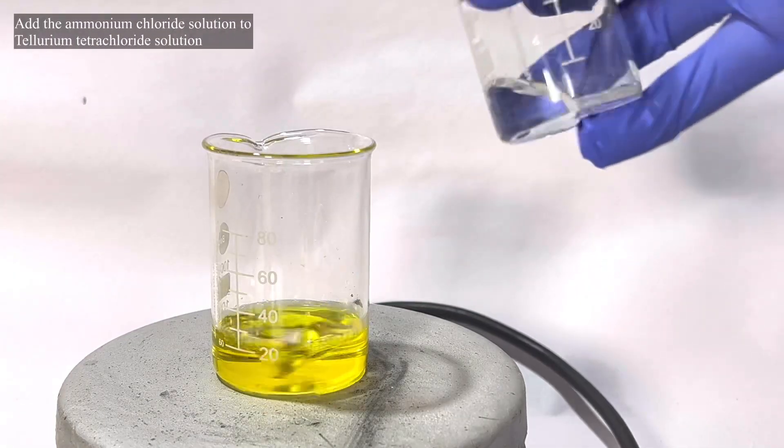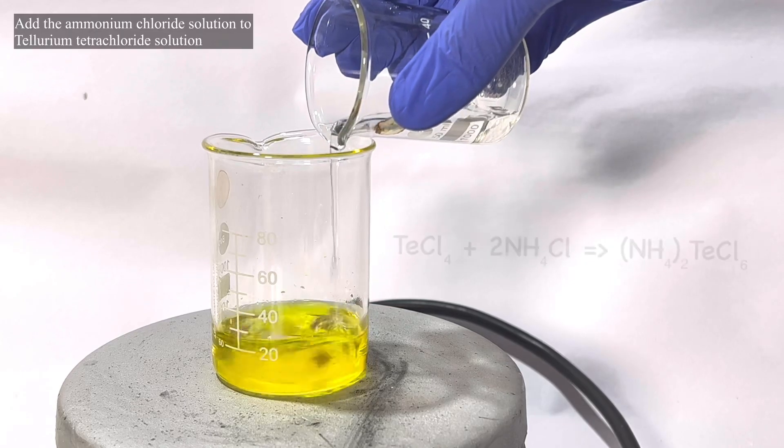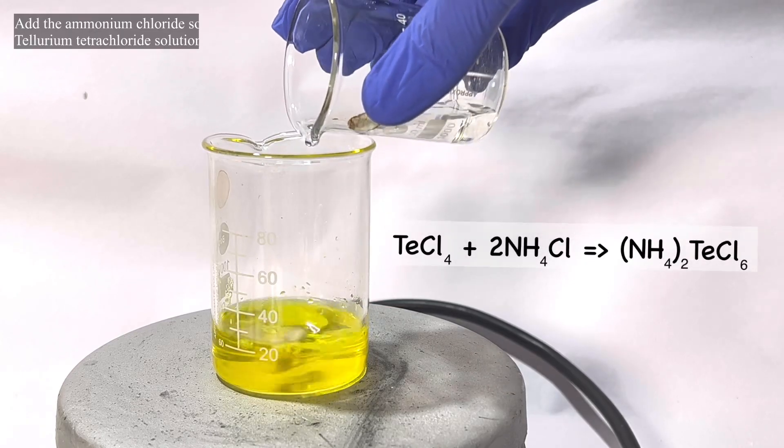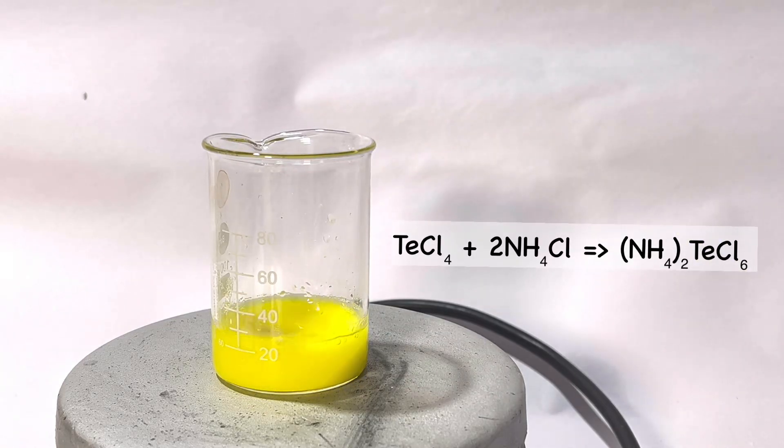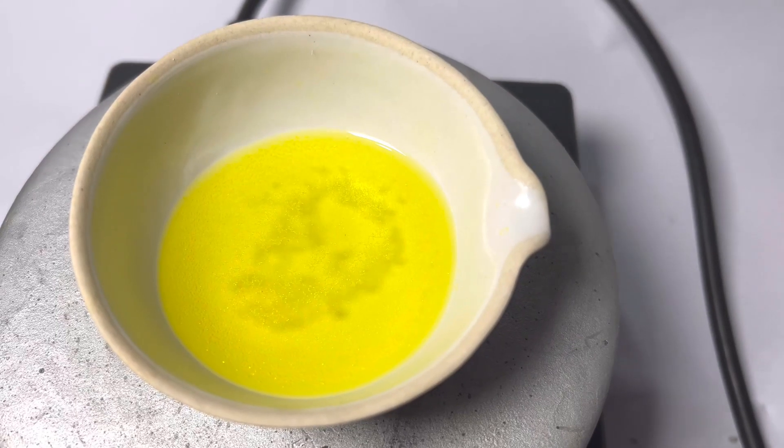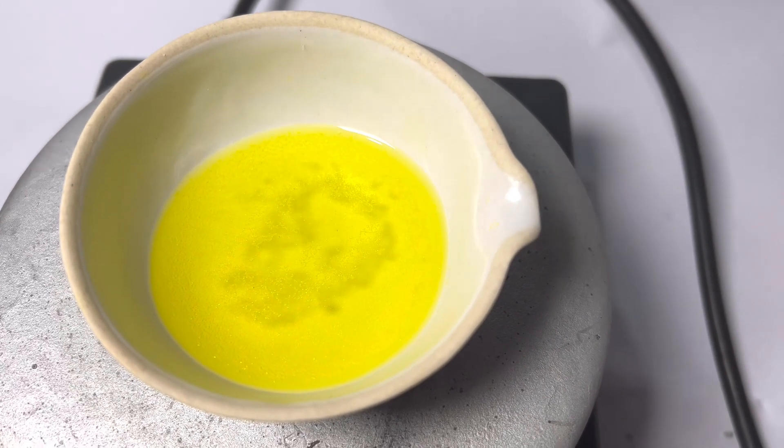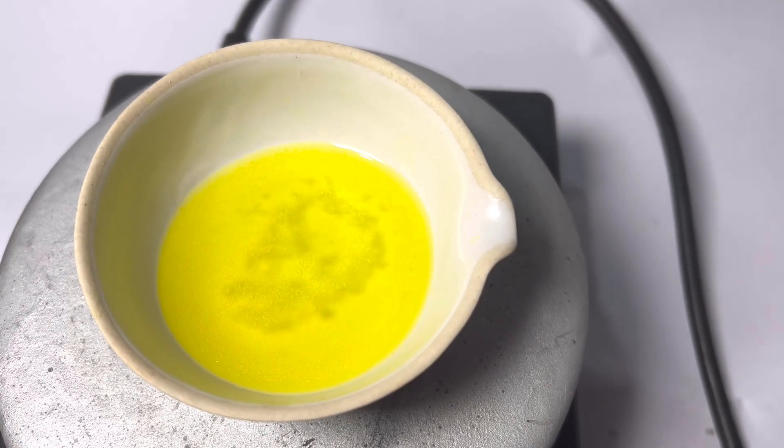The ammonium chloride solution was added to the tellurium tetrachloride solution, and all of a sudden bright yellow precipitate of ammonium hexachloride tellurate precipitates out. I wished I could see some of the crystals grow, so I quickly filtered the solution and allowed the filtrate to sit for some time. Soon some minute crystals were then seen in the porcelain dish.